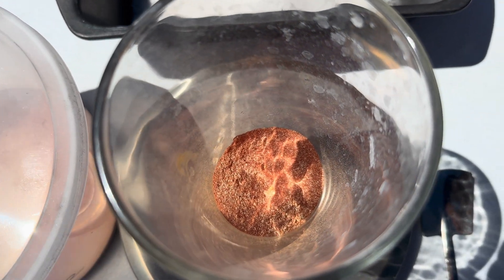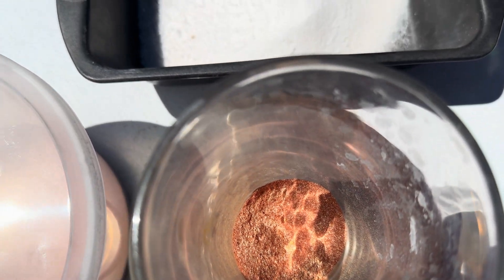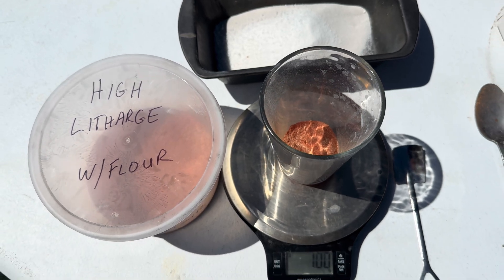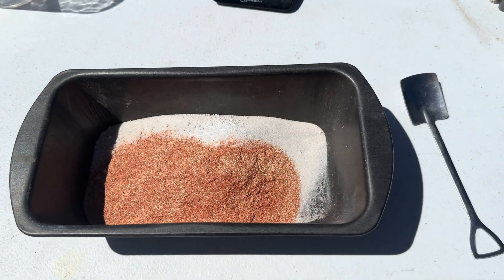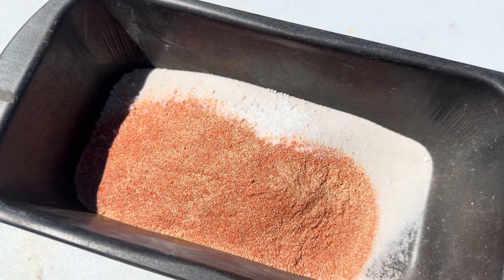I normally use about 30 to 50 grams of high litharge with flour whenever I'm doing a smelt, but by adding in 100 grams of litharge I should be able to get some type of measurable amount if there is any silver inside the litharge.